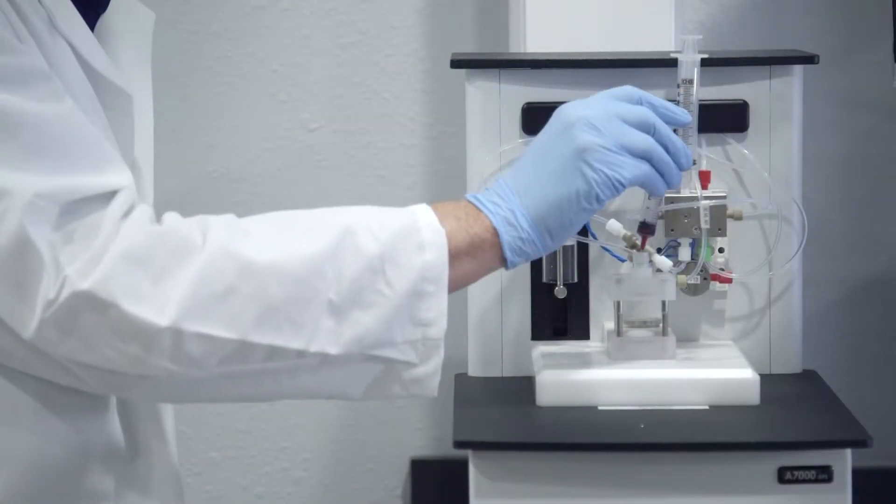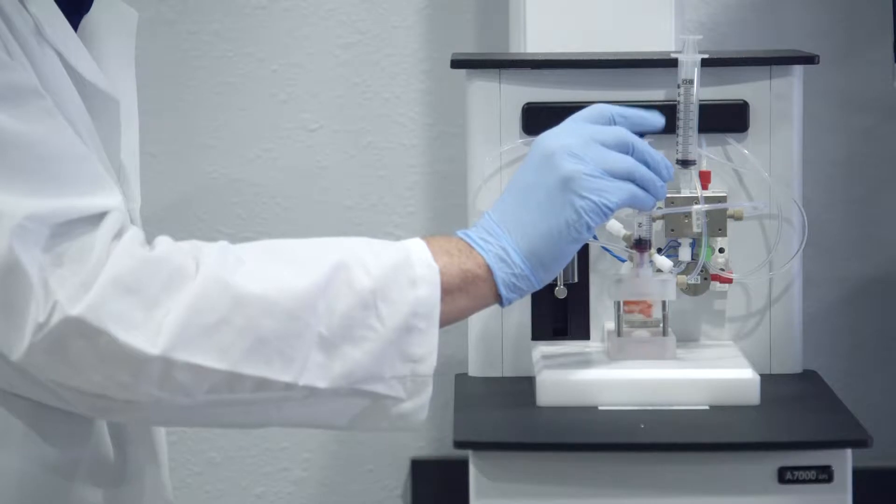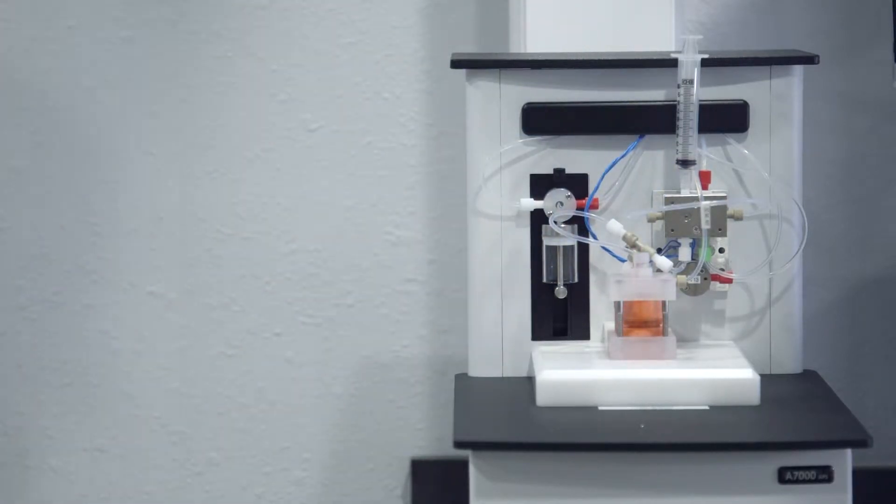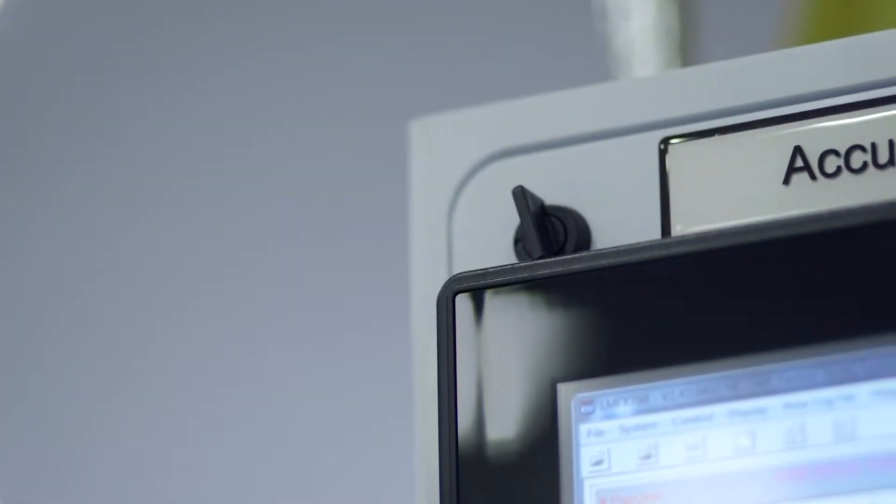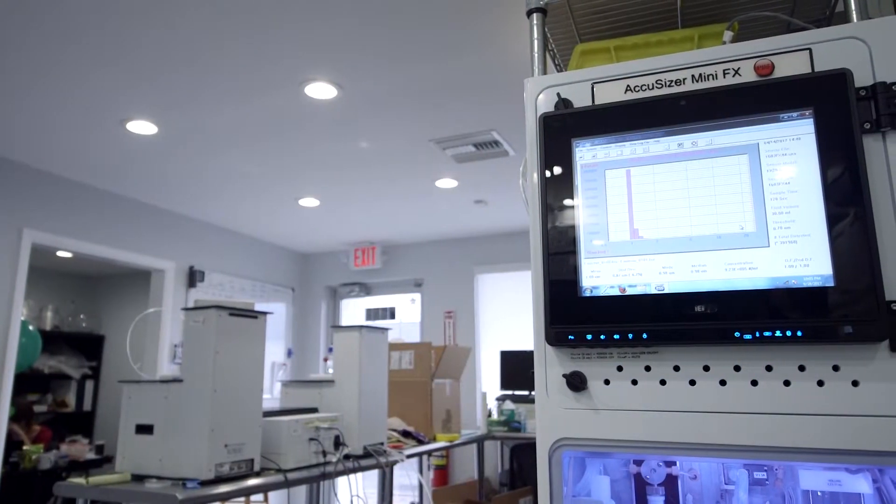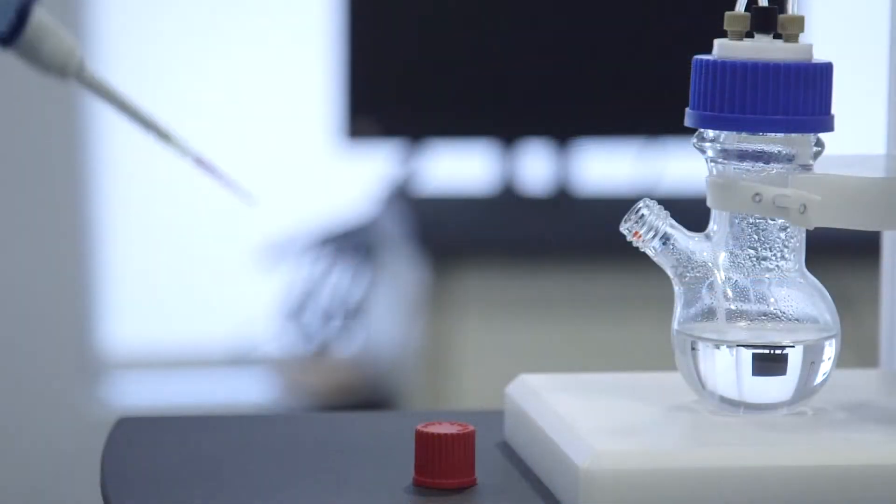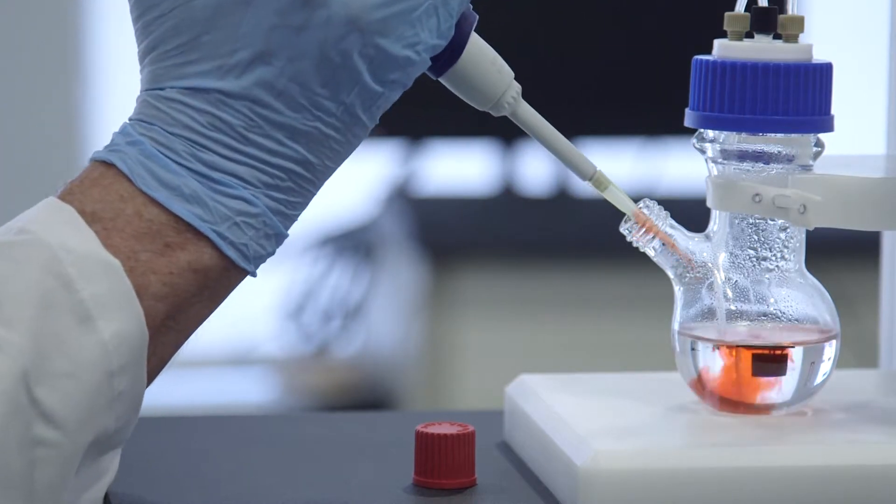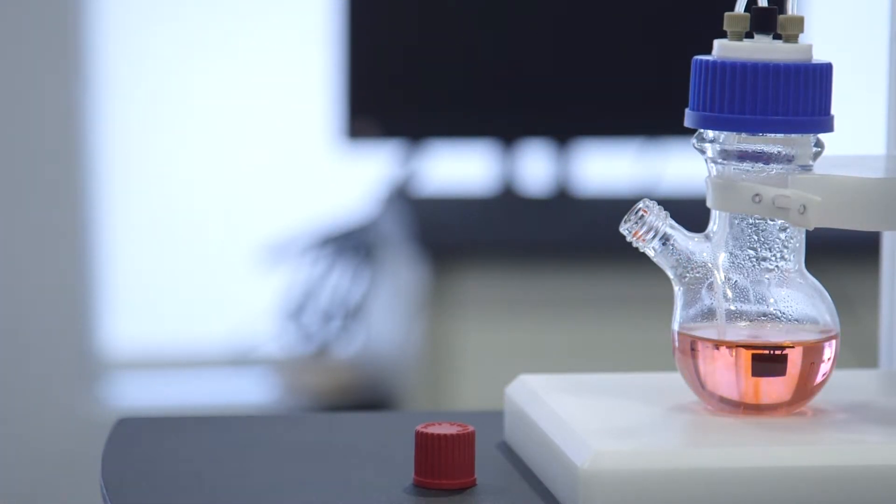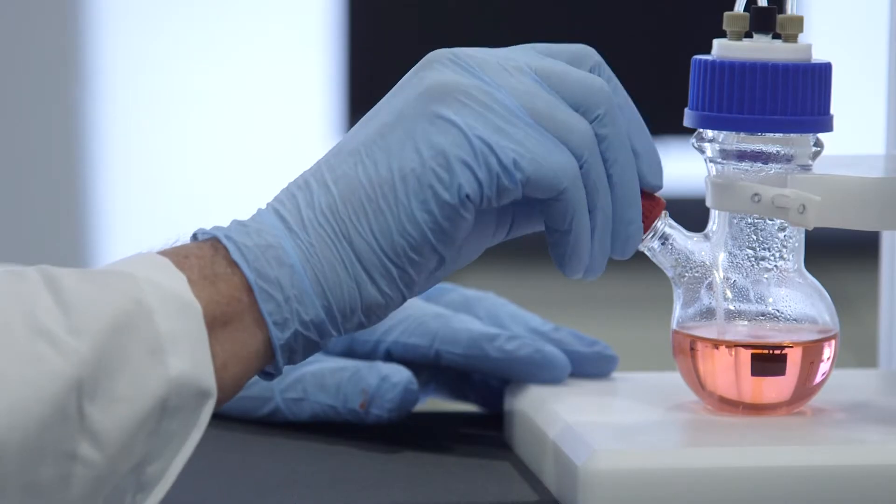The AccuSizer is used to count contamination particles in liquids ranging from parenteral drugs to water and hydraulic fluids. The AccuSizer is the industry standard for detecting large particle counts in CMP slurries and is used as a particle size analyzer in the pharmaceutical, ink, and emulsion industries.